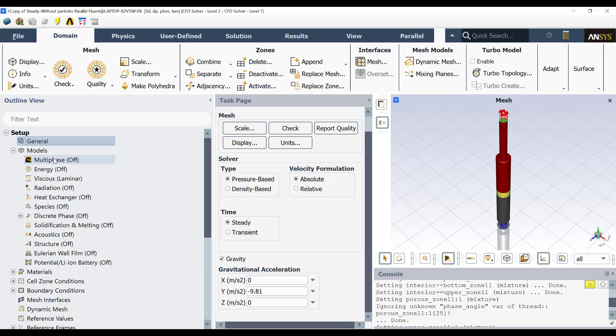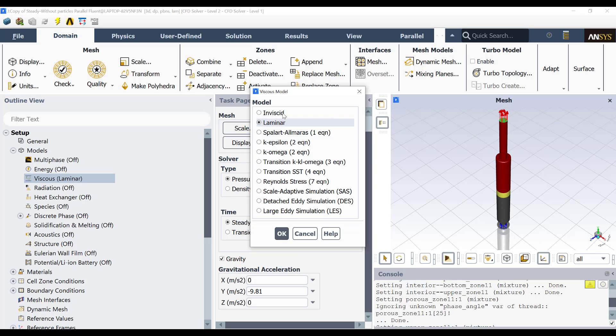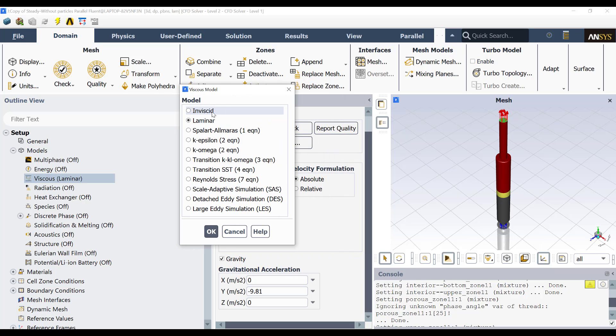Also, in models, you will see that the velocity of the flow is very low. Then initially we can use a laminar approach. If you consider that the Reynolds number is high enough to consider the turbulent effects, then you can double click here and you can select the turbulence model you want to use or you consider to use. I recommend using the K-Omega or the K-Epsilon.